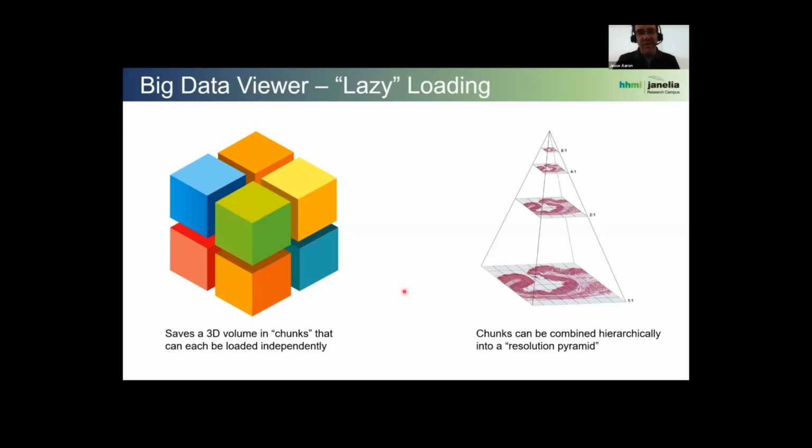So it relies on a couple of different things. First, it's going to take a 3D data set and divide it up into little chunks. And that's exactly what they call them: chunked data sets. If you can imagine your 3D image stack is just a big 3D matrix of numbers, we're going to divide those up into little clusters, say not more than maybe 128 pixels by 128 pixels by 128 pixels, for example.